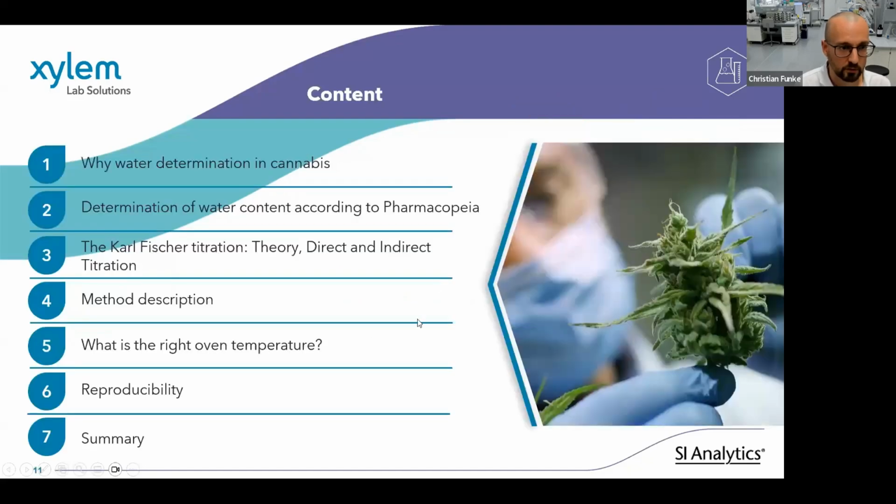Okay, so let's start with the webinar. First, I want to give you a short overview about the content of today's webinar. We will start with why we are interested in the water content of cannabis, and how the water content is determined according to pharmacopoeia.